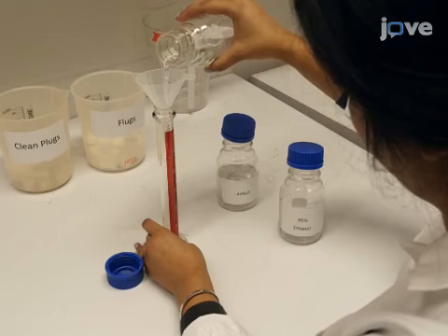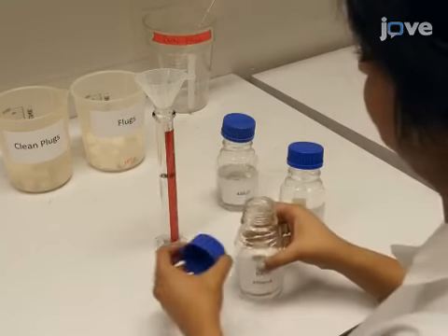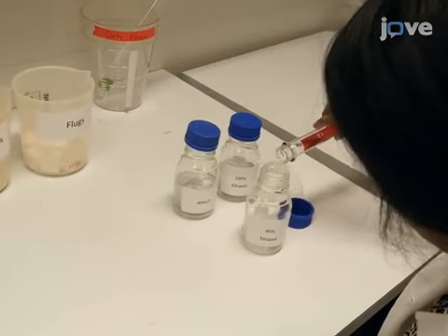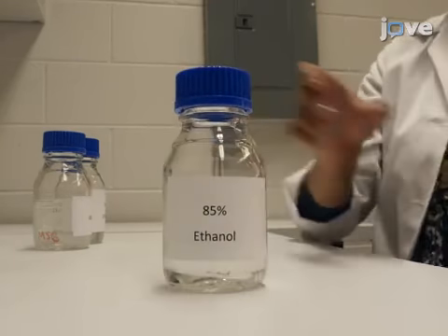Prepare ethanol solution by diluting pure 100% ethanol in purified water to a final concentration of 85%. Allow the solution to return to room temperature overnight.